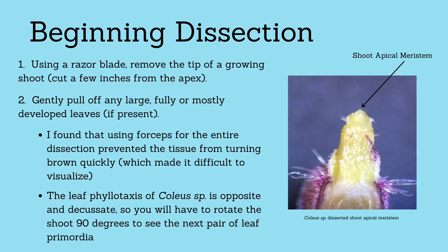To perform this dissection, first a razor blade will be used to remove the tip of a growing shoot. I generally cut 2-3 inches from the tip to have enough room to hold it while performing the dissection. Then, before going under the dissecting scope, gently remove any large fully or mostly developed leaves.